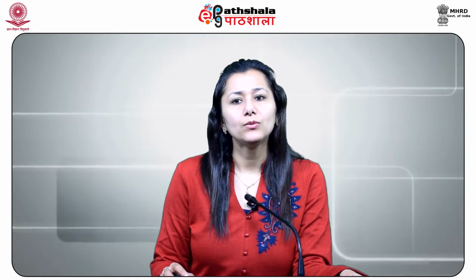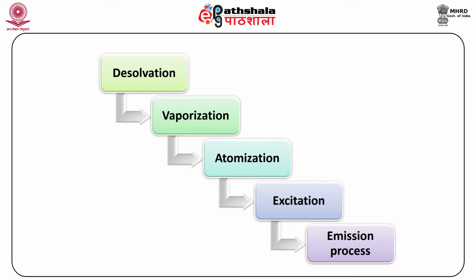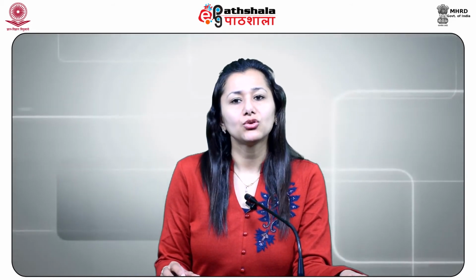Fuel-oxidant ratio is very important in the flame. It is responsible for maintaining the flame temperature. Following is the description of events going on in the flame: desolvation, then vaporization, then atomization, then excitation, and then the emission process. In desolvation, the metal particles get dehydrated after coming into contact with the flame, resulting in the evaporation of the solvent. The vaporization process is similar to desolvation.